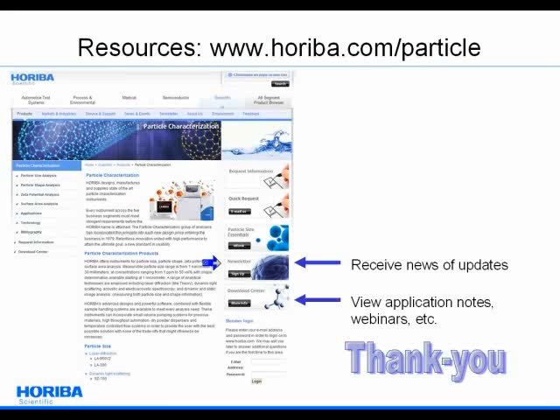Yeah, the lysozyme at 3.4 nanometers, no problem at all. I haven't personally worked with particles under 3 nanometers for zeta potential yet. If I had like gold nanoparticles that scattered really well, I probably could. I just haven't generated that data myself yet. Good question.